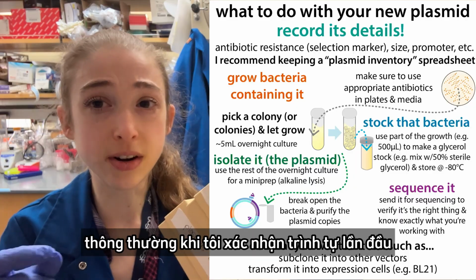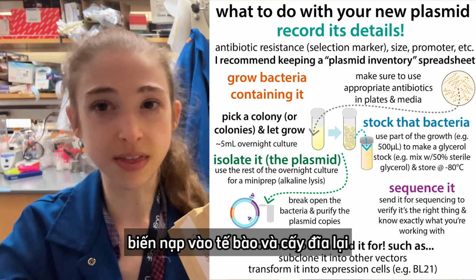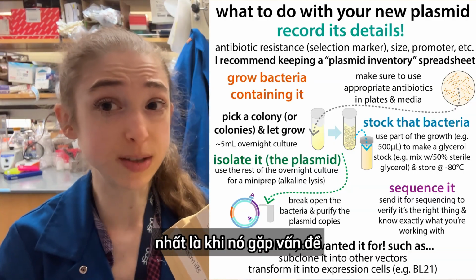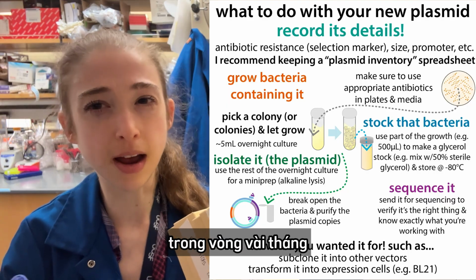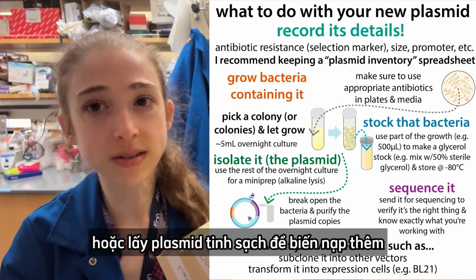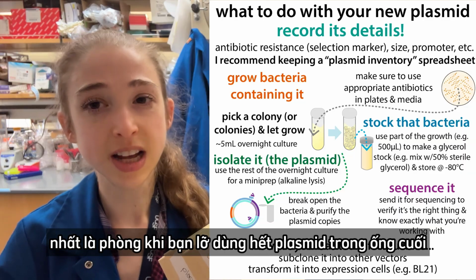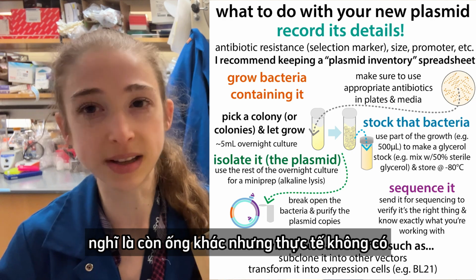So usually once I verify the sequence that first time after the cloning, on the next plate after I've just done the transformation into the cells and plated them again, I don't sequence again at that point. I might later on sequence the plasmid, especially if I'm having some problems with it, but typically I could just go back to that plate within a couple months or so, and if it's longer term, then I'll go to that glycerol stock, or I'll take that purified plasmid and transform more of it and make more. But it's always nice to have that backup as the glycerol stock, especially in case you accidentally use the last of your plasmid thinking there's another tube and there isn't.